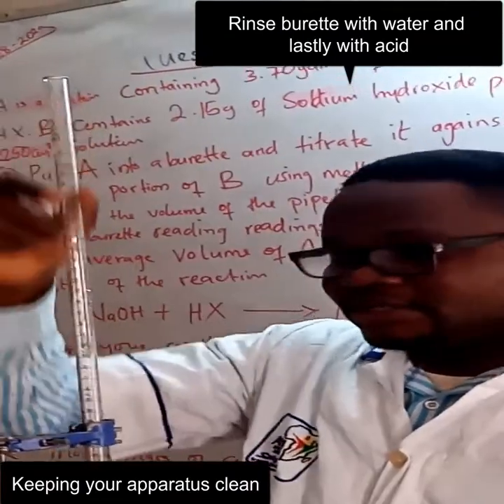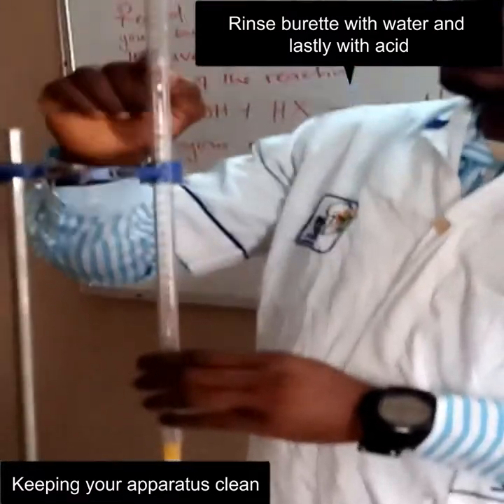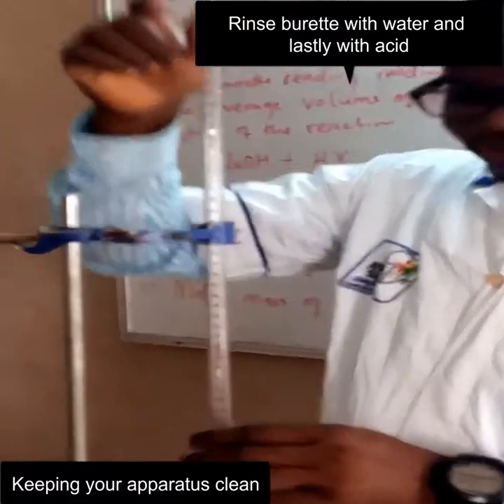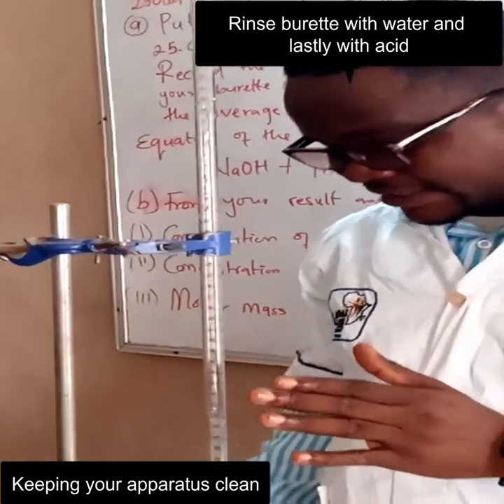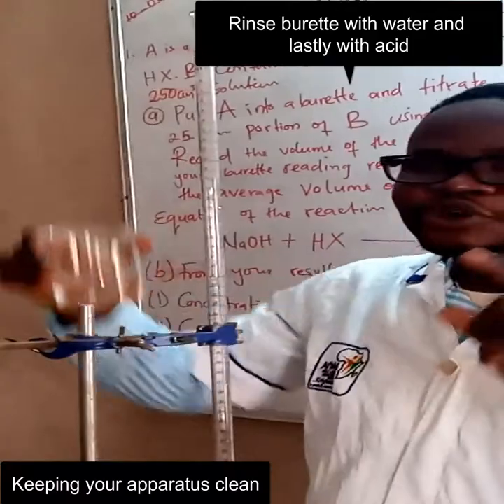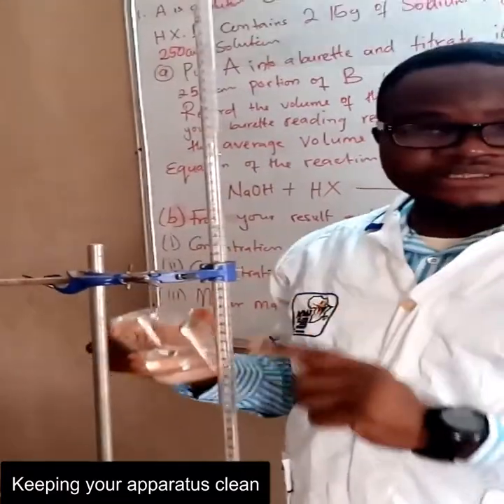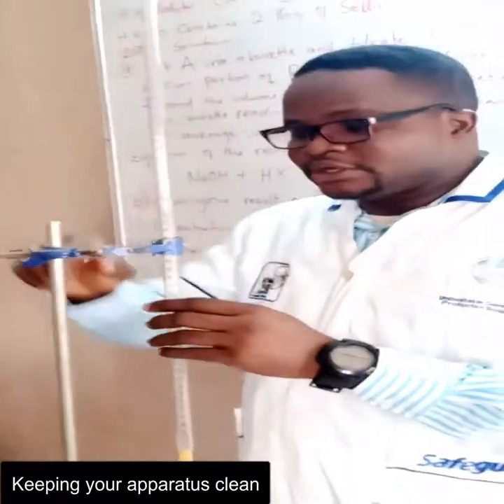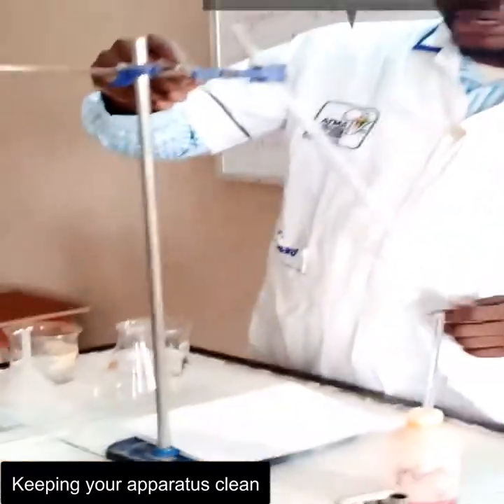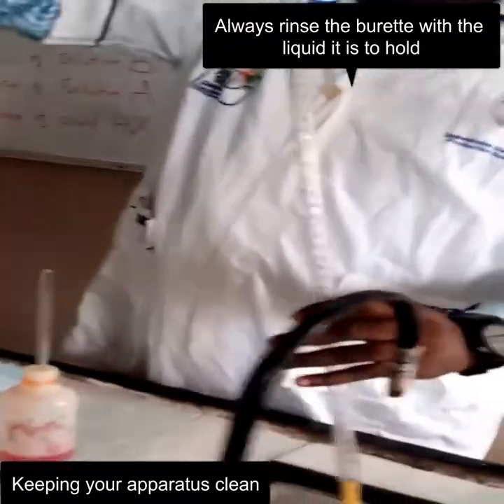After rinsing this with water, you can see — rinsing this particular apparatus with water — I have droplets of water inside. So if I want to start my experiment and I decide to pour my acid into this directly, it's going to affect the concentration of the acid because I already have water droplets inside. So what you do is, you have to rinse this particular buret with the acid that the buret is to hold.